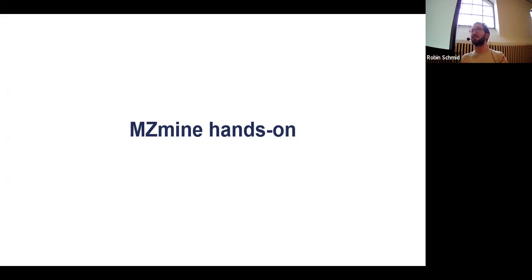But personally, I think just having smarter algorithms that keep track of, oh wait, this one I already saw, or maybe I tried to fragment, but the energy was not high enough, so maybe next time I apply some more energy. Of course, this is all processing that needs to happen. But I think those kinds of things, at least to me, make more sense for the future. But let's see, at least in the proteomics field, it's applied with great success already. So maybe it also swaps over to metabolomics.